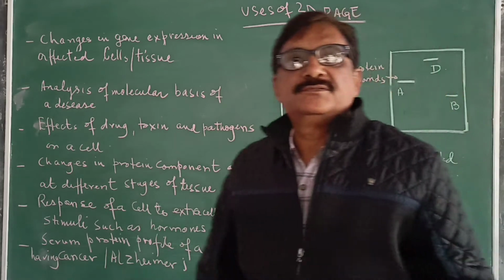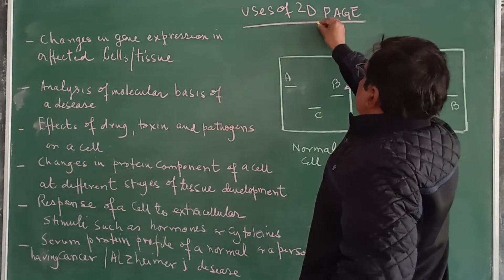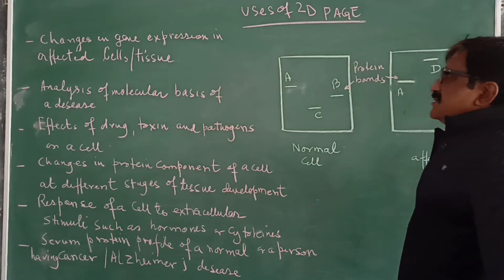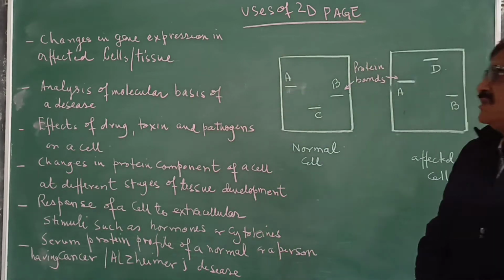We discussed the mechanism of 2D PAGE, two-dimensional polyacrylamide gel electrophoresis. Today we will discuss the uses of 2D PAGE.